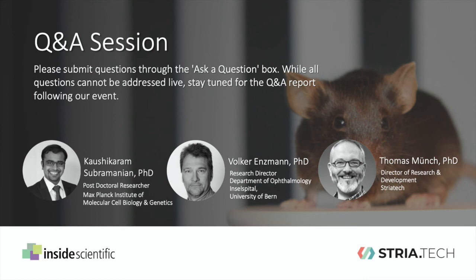Again, this shows the importance to have a proper control. So in the OptoDrum, you can measure the optomotor reflex of all mice. But as the examples I mentioned above show, the absence of the optomotor reflex in a specific mouse line may reflect a biological deficit that may not be related to your primary research question.